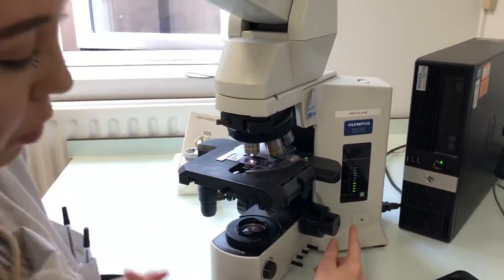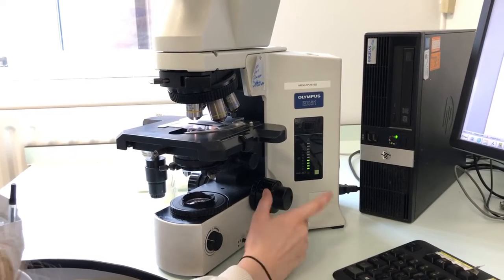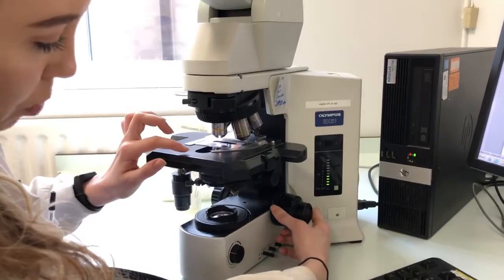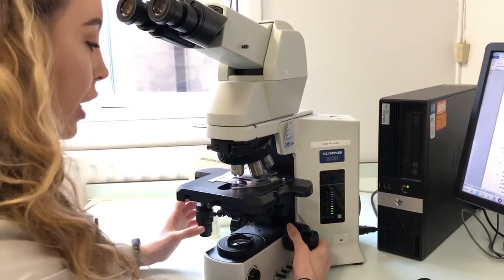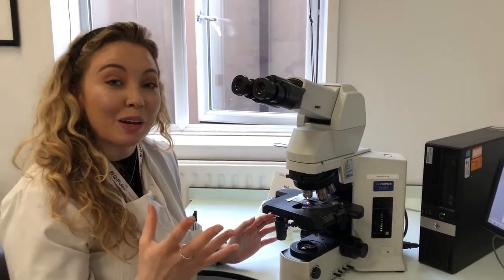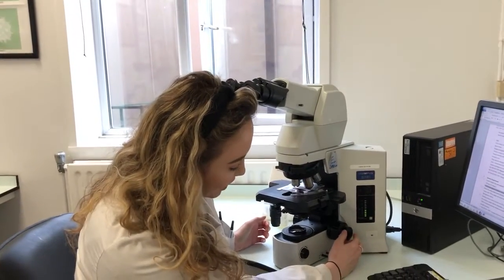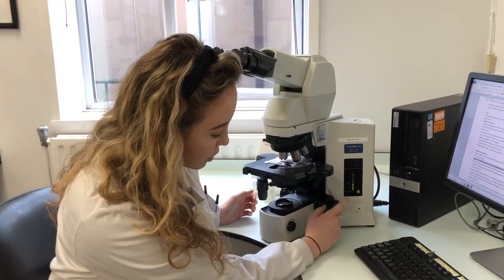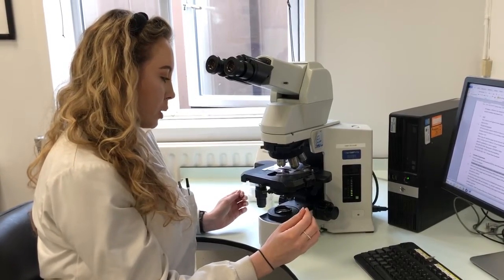At the side here, we have the coarse focus and the fine focus wheels. The coarse focus allows us to move the stage up and down, and this will give a broad sort of magnification. It's not very specific or detailed. The fine focus finely tunes in the details. So it's a broad and a fine focus wheel that helps us tune into the cell types.